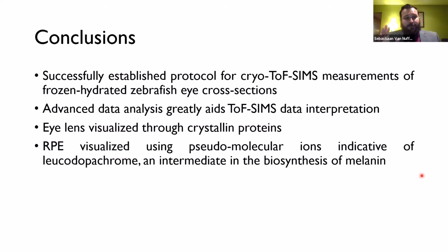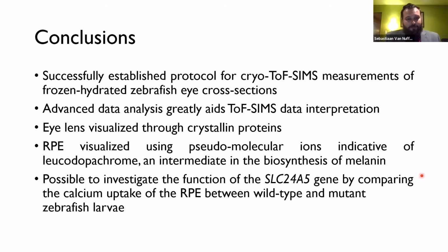And now we have all the tools in our hands to investigate the function of this SLC24A5 gene and start comparing the calcium uptake between their epithelium, between wild type and mutant zebrafish larvae.